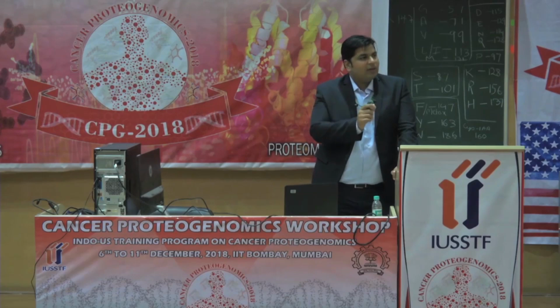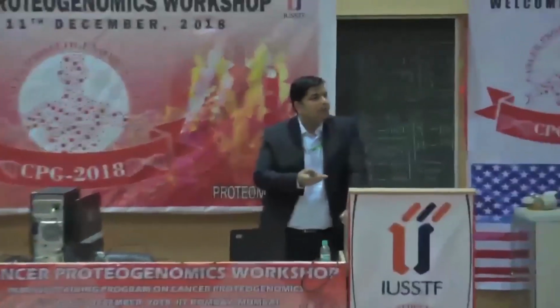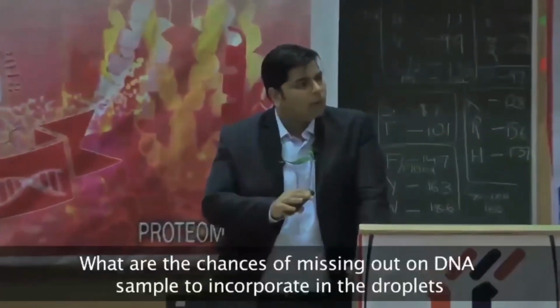Your question is about the SD, right? The standard deviation that you would get from each 3 replicates that you get, correct? That's required because you might consider that your handling might be different. There will be pipetting errors, to take care of those things.